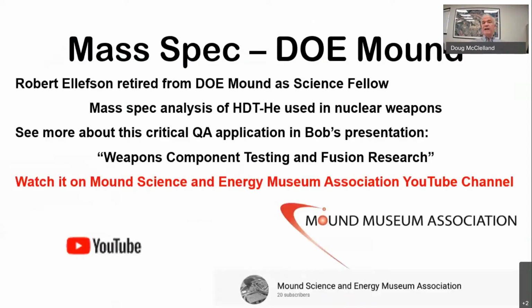How is it used? At DOE Mound Lab, Dr. Ellefson was the expert, and he was the science fellow here at Mound in charge of the mass spec operations. If you'd like to see how the mass spec was used in the DOE Mound Lab, I would encourage you to go to the Mound Museum YouTube channel and take a look at the weapons component testing and fusion research presentation that Bob has posted there. That'll show you some applications of the mass spec in the DOE lab.